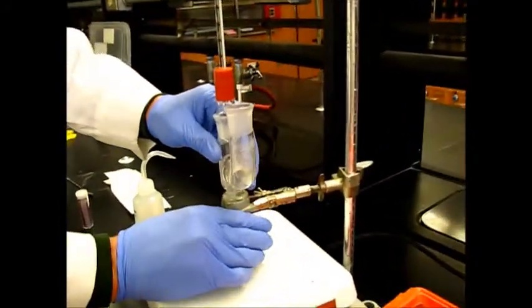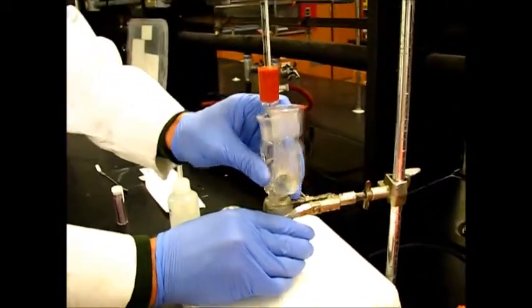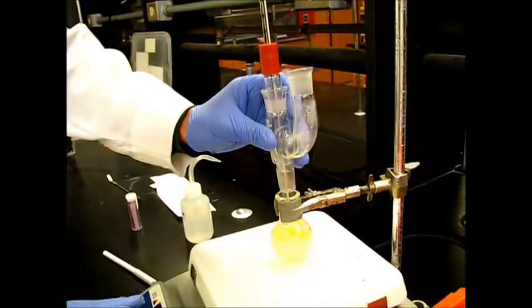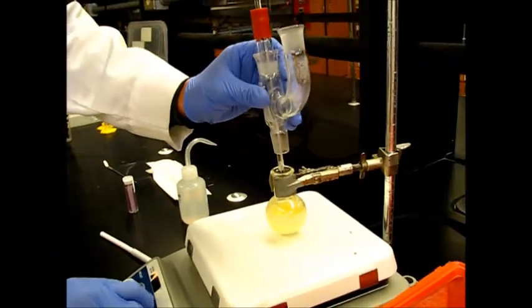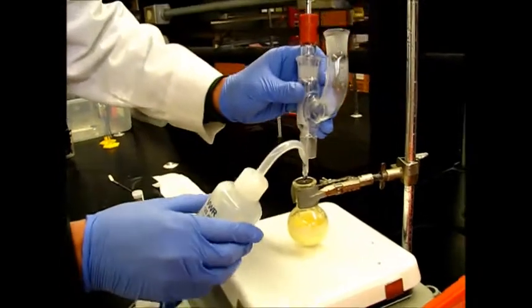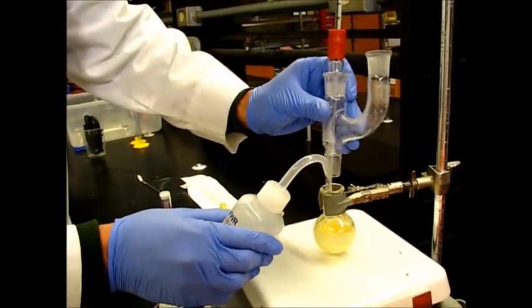We're going to start by removing the Claisen adapter. We're going to turn off the stirring as well and rinse off the thermometer.